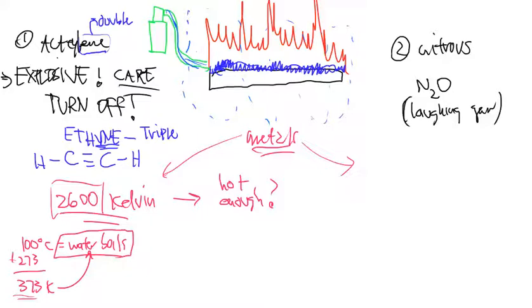Okay, so that N2O tank is probably going to be a little bit smaller because we don't need to use it that much. The N2O tank creates a hotter flame that we need for the AA sometimes. And that tank can go all the way to 3100 Kelvin.